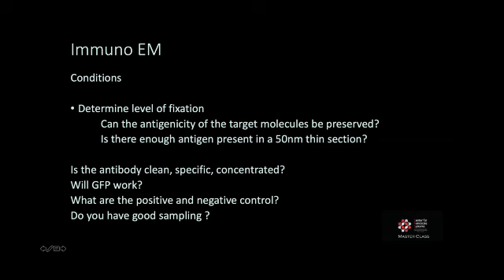Will GFP work? There are a lot of really good anti-GFP, anti-RFP, anti-HA, anti-Myc antibodies that are working at the EM level. So if you've got a clean, clear localization of your GFP, going to EM is probably going to be successful.